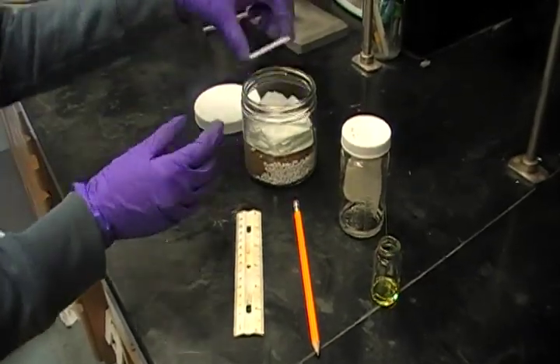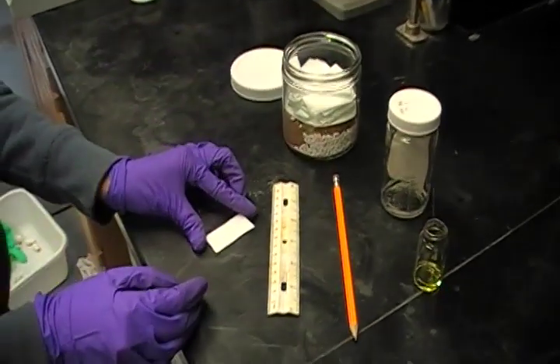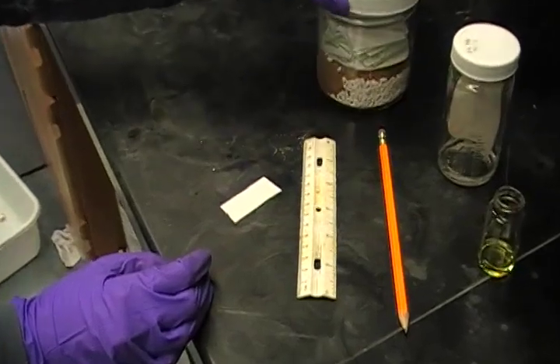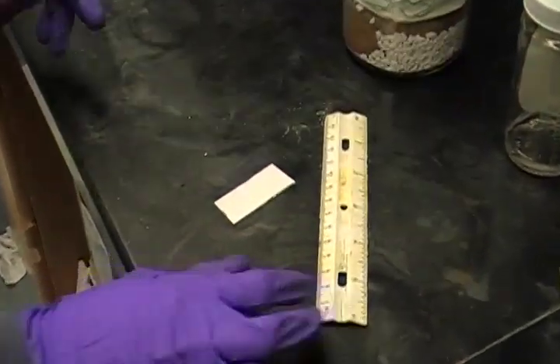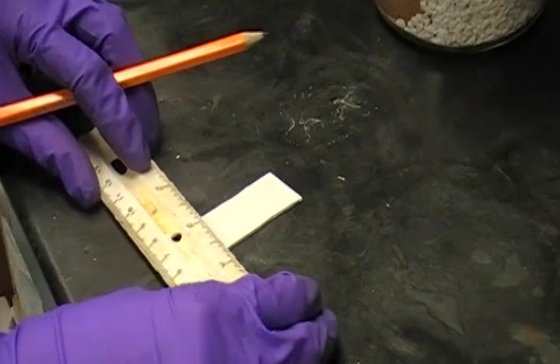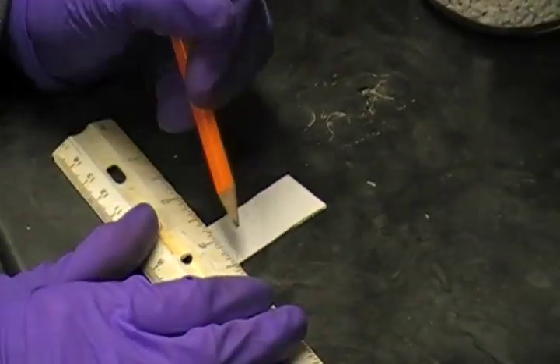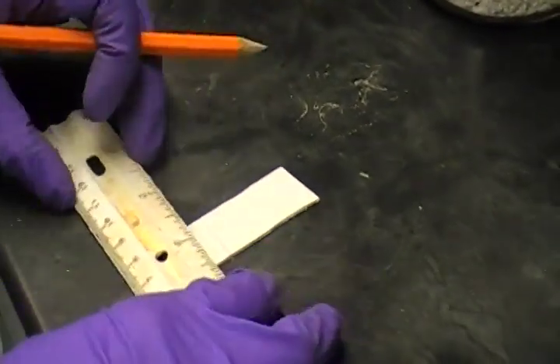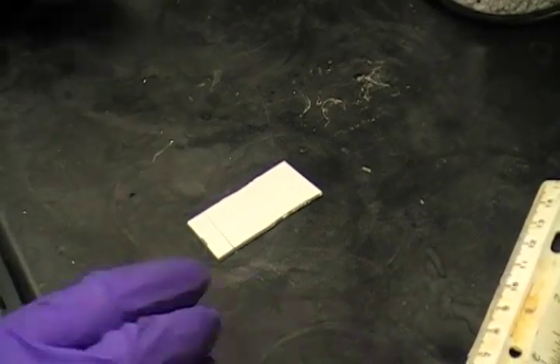To start, we take a clean TLC plate and very carefully draw a line on the bottom of the plate with a pencil, followed by a little tick to know where to spot our compounds.